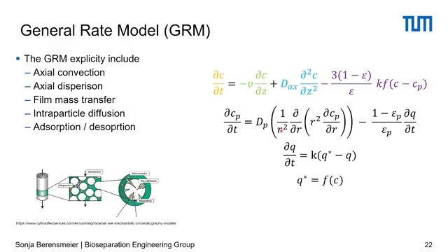And here you see a lot of r squared. So now this takes into account the spherical shape of our particles, so that it obviously takes some time for the molecules to diffuse into the particle, correct? So that is taken into account here. So here the geometry is taken into account, and then at the end we have the equation again that makes a transfer between the fluid phase inside the particles to the actual surface, the stationary phase. So this general model captures everything that you can see down here on the bottom left in this graphic that we have already talked through sometimes.